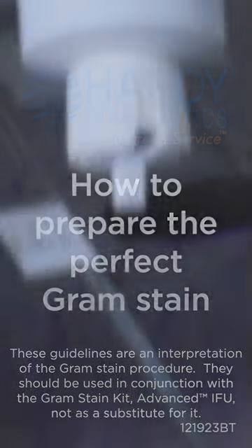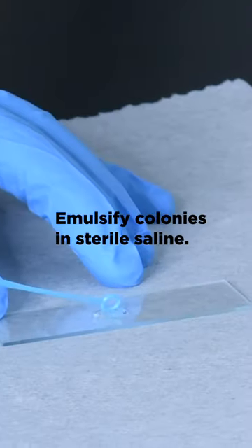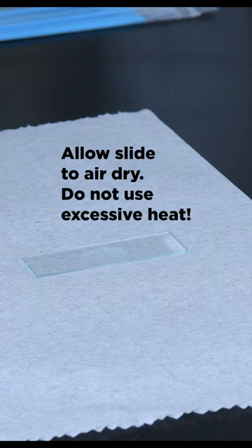How to prepare the perfect gram stain. Apply the test microorganism to a clean glass slide. Emulsify colonies in sterile saline. Allow slide to air dry.